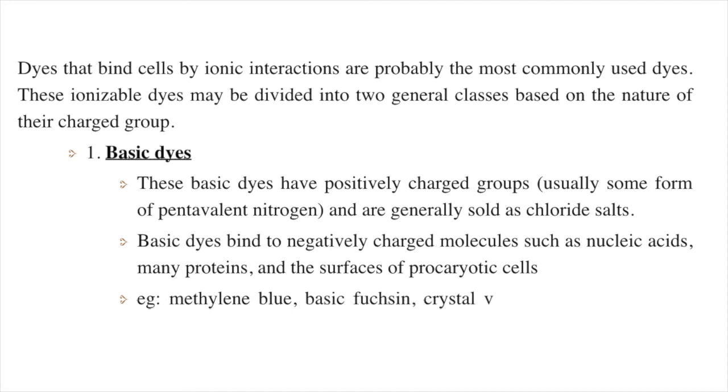What are the examples of the basic dyes? Methylene blue, basic fuchsin, crystal violet, safranin and malachite green are some of the examples of the basic dyes.